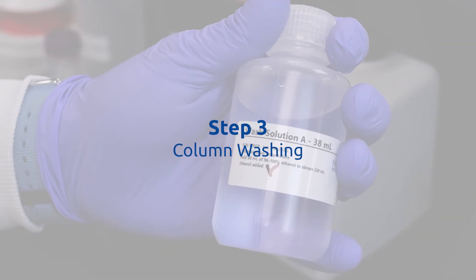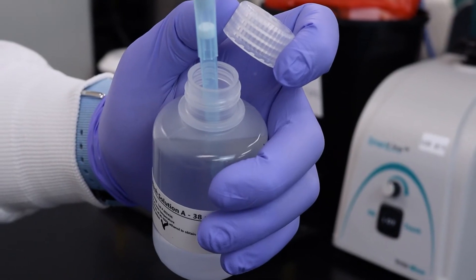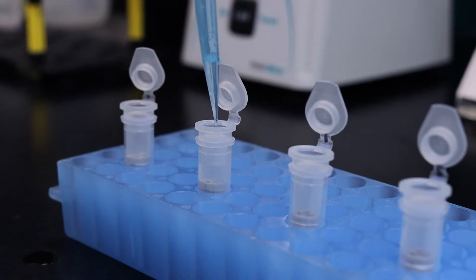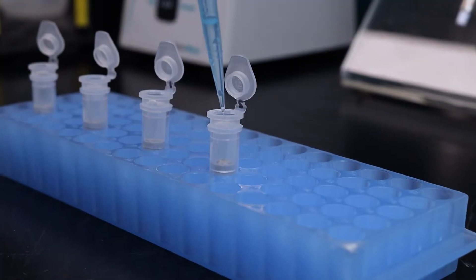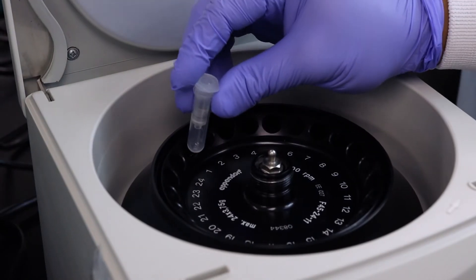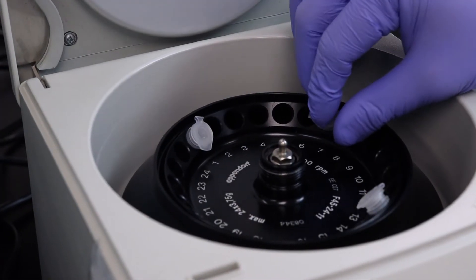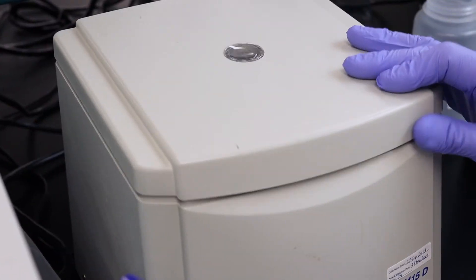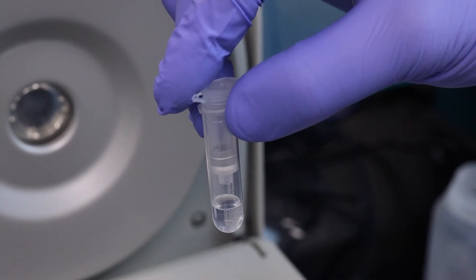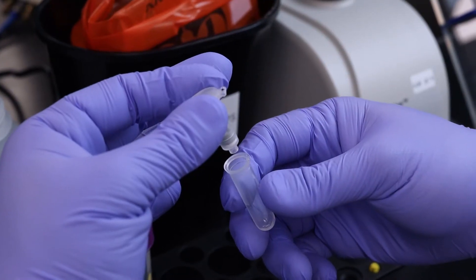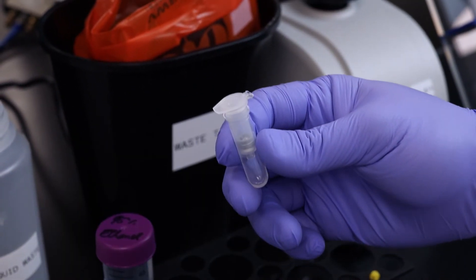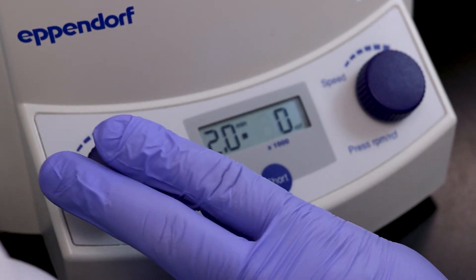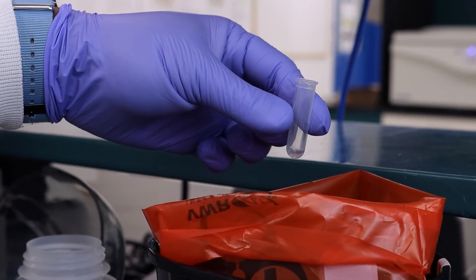Step 3. Column Washing. Apply 400 microliters of wash solution A to the column and centrifuge for 1 minute. Discard the flow-through. Repeat the step 2 more times for a total of 3 washes. Spin the column for 2 minutes to thoroughly dry the resin. Discard the collection tube.